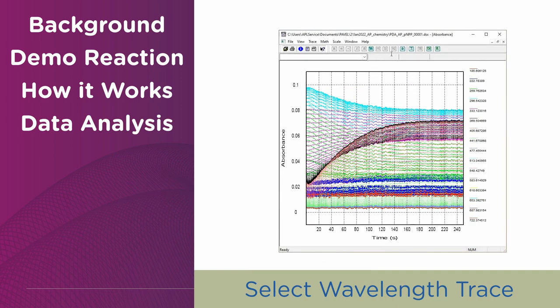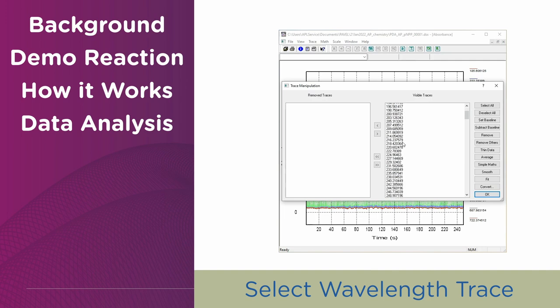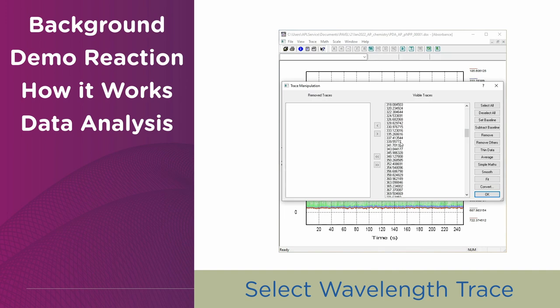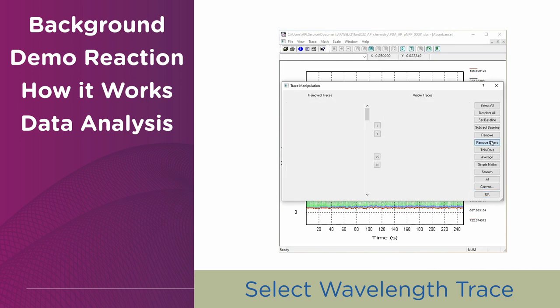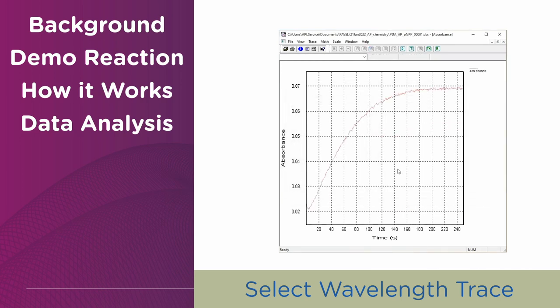After data collection, we can focus on a specific wavelength trace that we'd like to obtain a rate constant for. In this case, it is around 410 nm. For that, we remove all other traces and then proceed with data fitting.